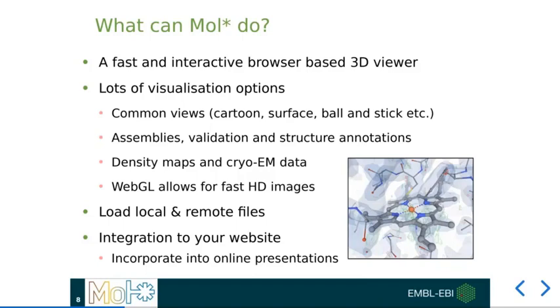Lastly, it's worth quickly highlighting that I've actually been able to embed Mol* directly into today's presentation using an iframe component on the slides.com presentation website. Technically, I couldn't find a way to do so with Microsoft PowerPoint or Google Slides. However, I thought it worth mentioning quickly, as in the past, I've spent a lot of time looking at ways of incorporating 3D structural data into my talks.